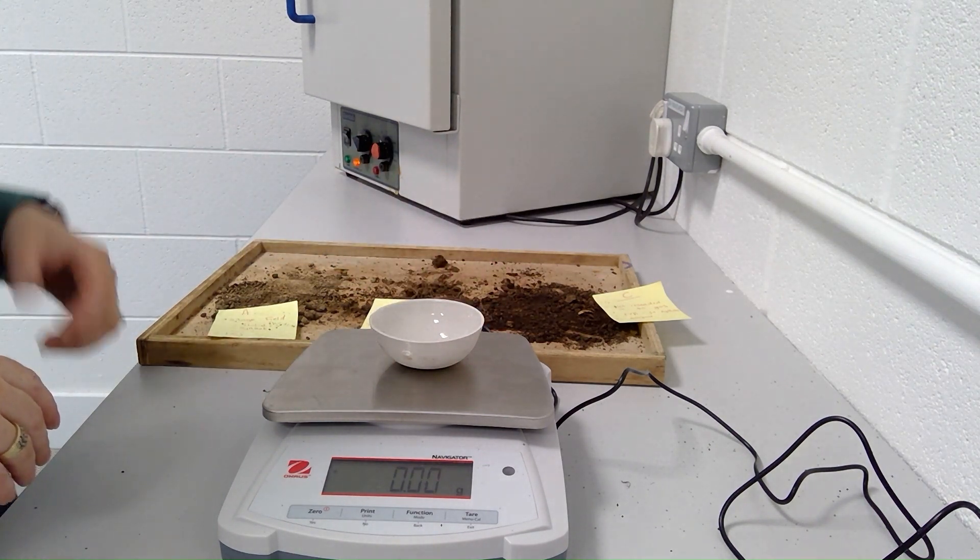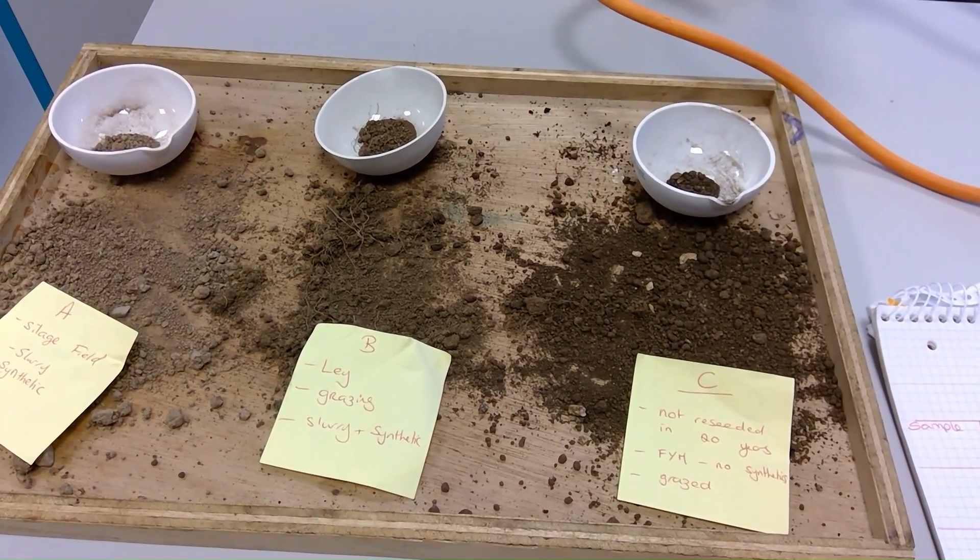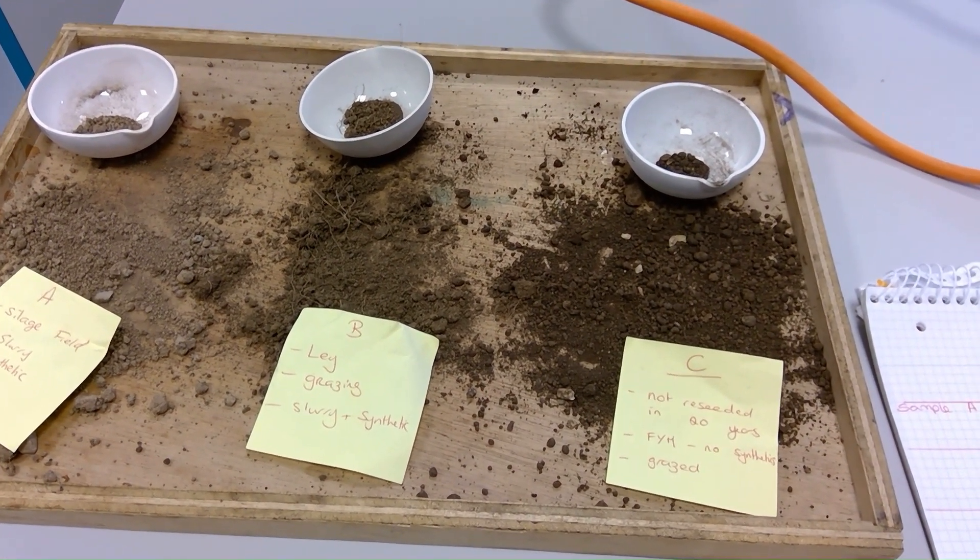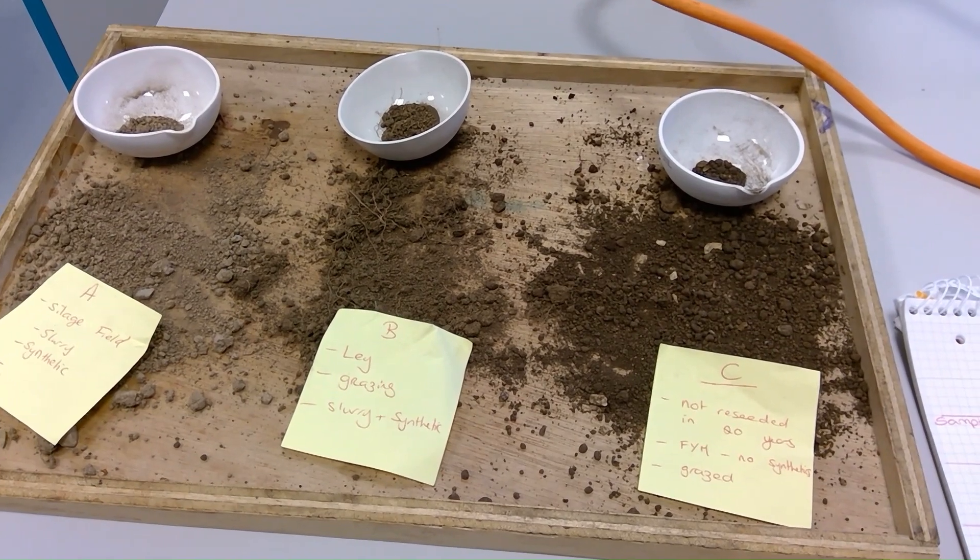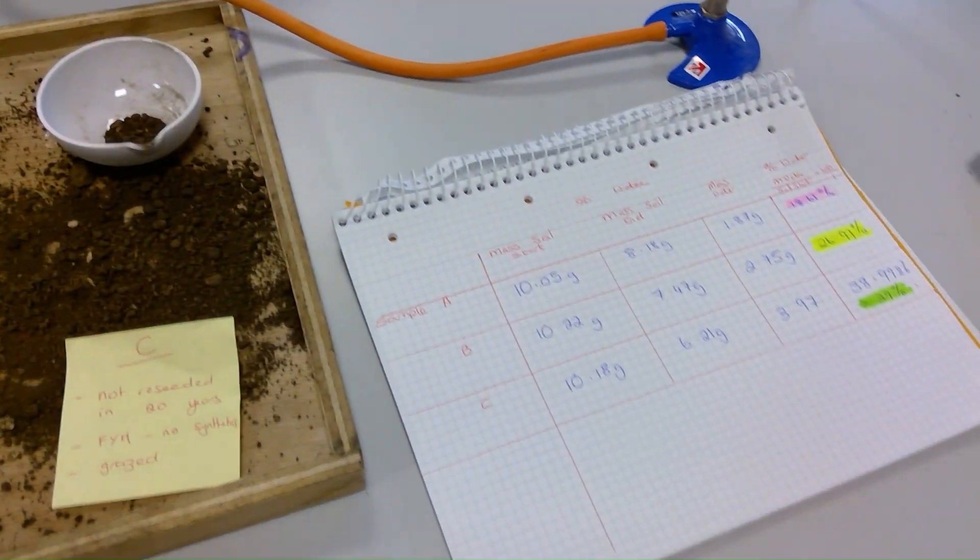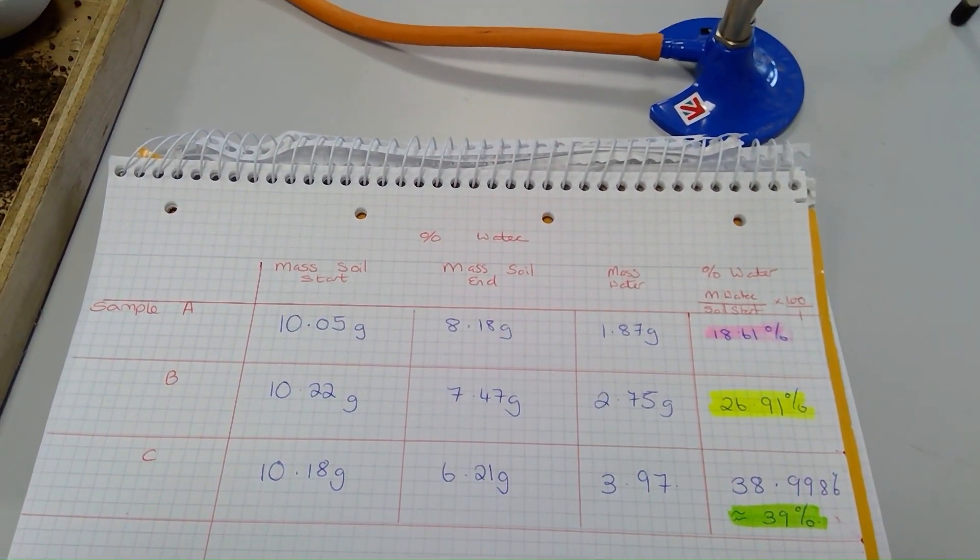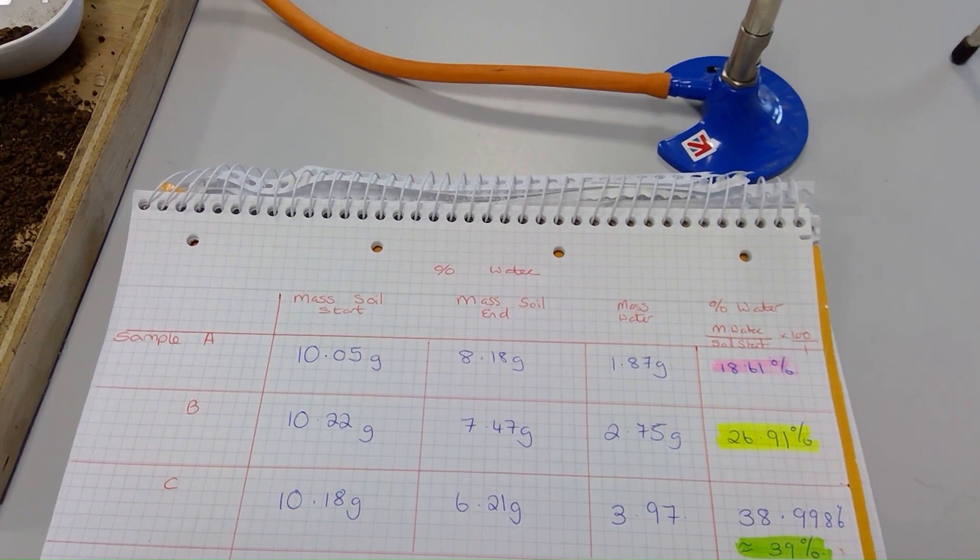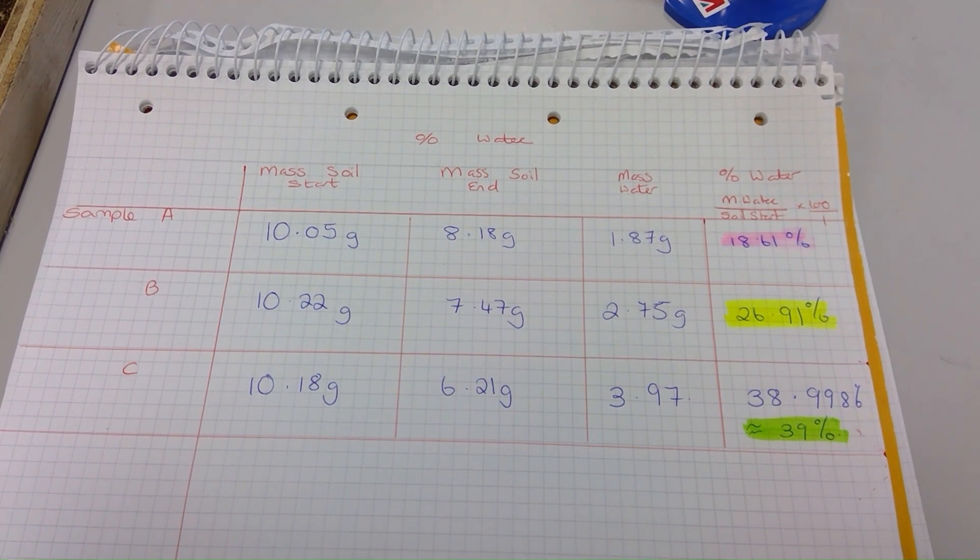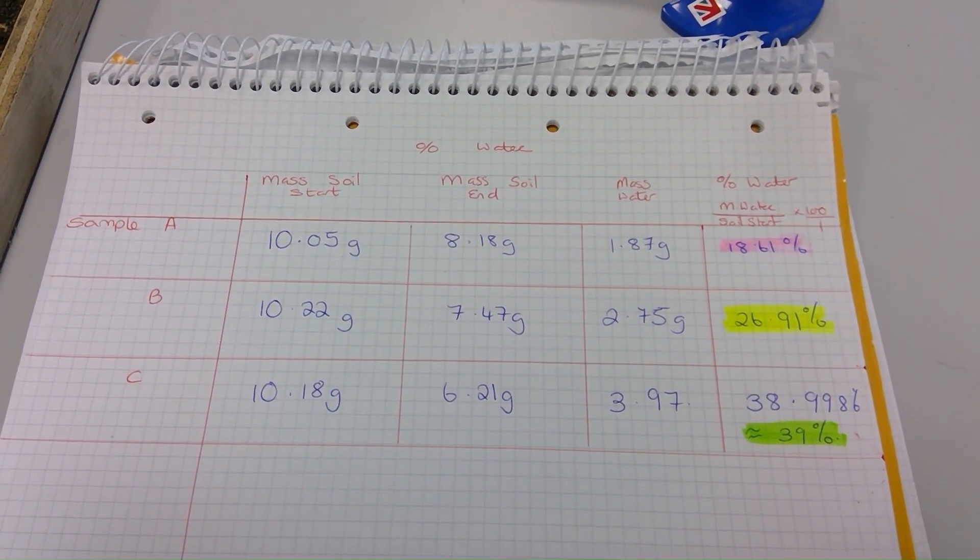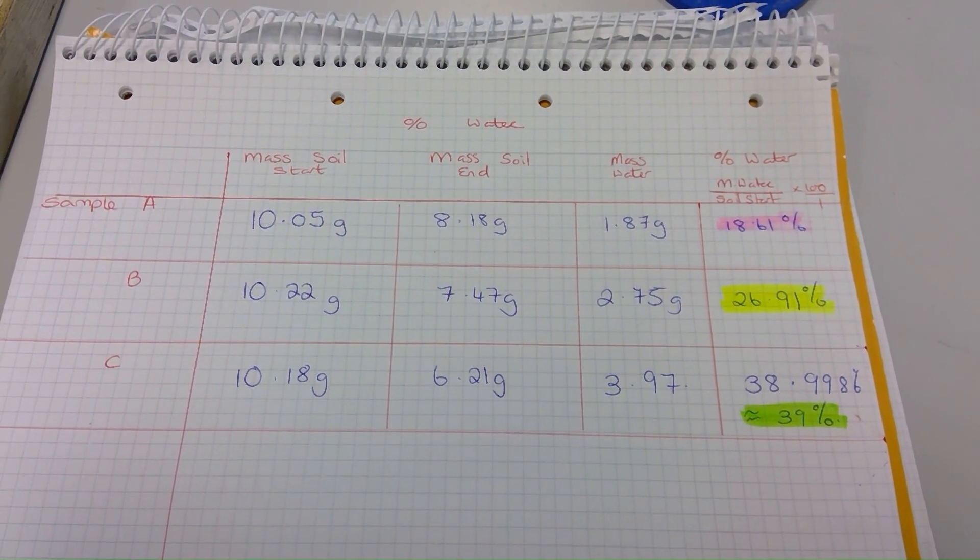I have removed these soil samples from the oven when their mass remains constant. It's interesting to note that these soil samples were sitting out on the bench for about two days before I put them in the oven. But if we have a look at the results, we can see that sample A, which was a silage field with synthetics and slurry, has a percentage water content of 18.61%. B, which was grazing, slurry, and synthetics, had a water retention of 26.91%.